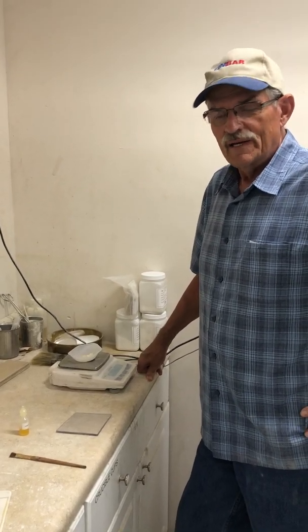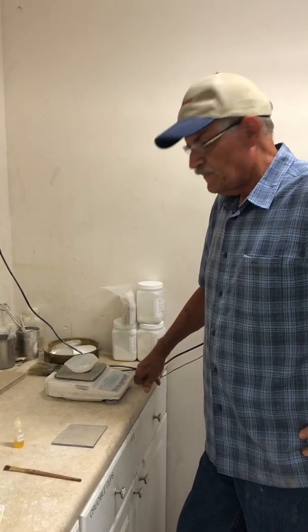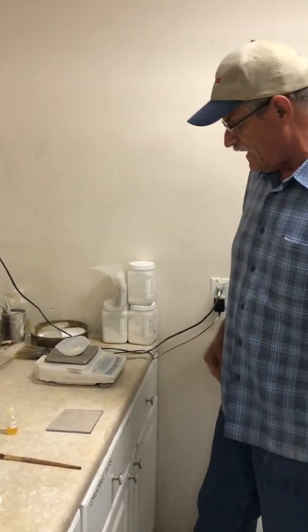Good afternoon. We're here to make a video on how to do an oil absorption test. We're using as our base product Baromite XF, which is a 3 micron product. I've got the 5 grams already weighed out.